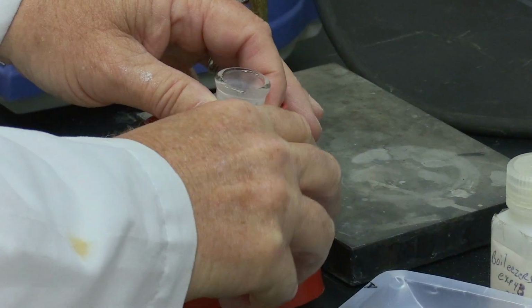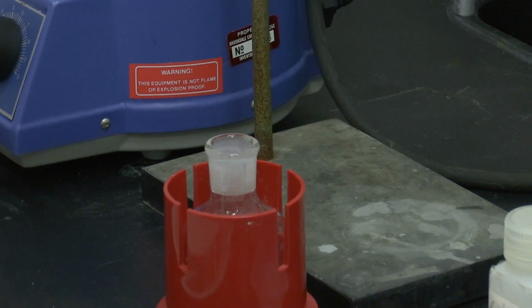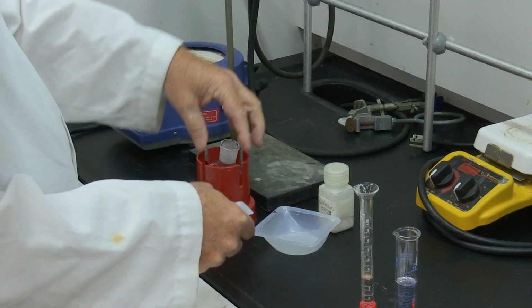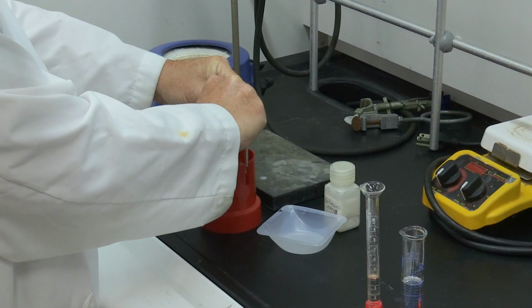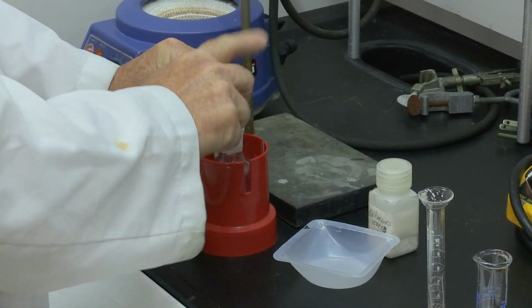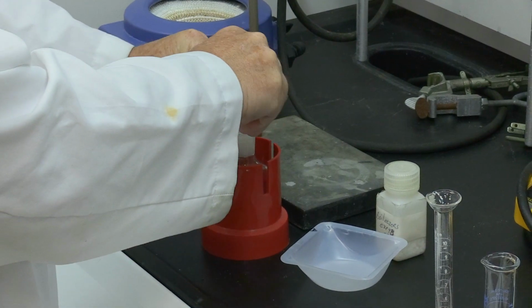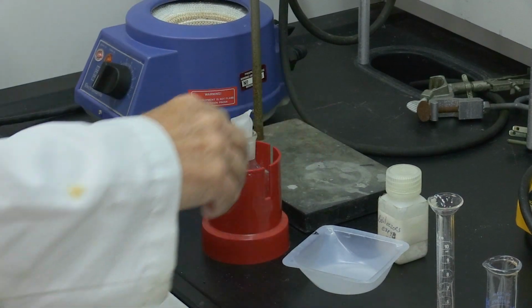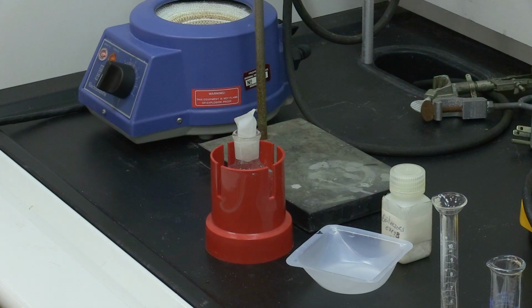Here's our fluorene. When you're preparing these samples, it's good to add the powder first because you don't want the powder to catch onto the side of the vessel. This is the potassium hydroxide, which picks up moisture. We're going to have to get a spatula to help put it into the flask.